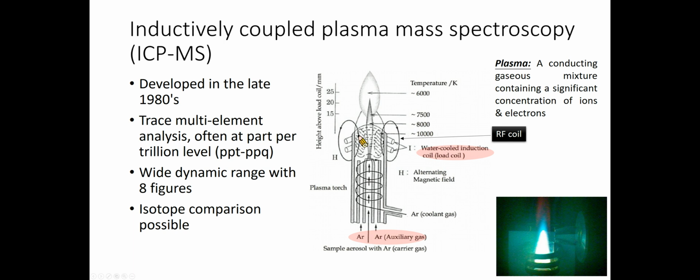basically a donut shape. What is especially impressive is that enough energy is absorbed from the magnetic field to heat the plasma up to a temperature of about 6000 K. As a comparison, this temperature is about the same as the temperature of the surface of the sun.